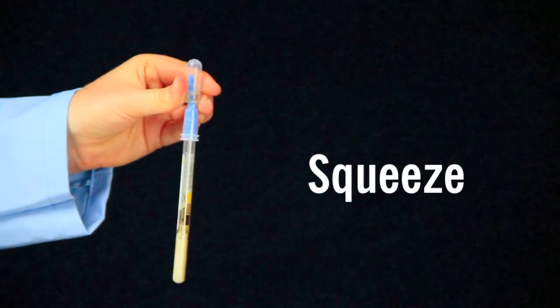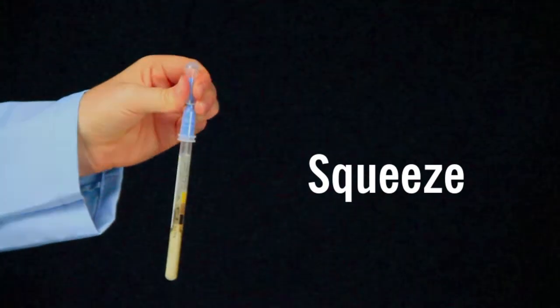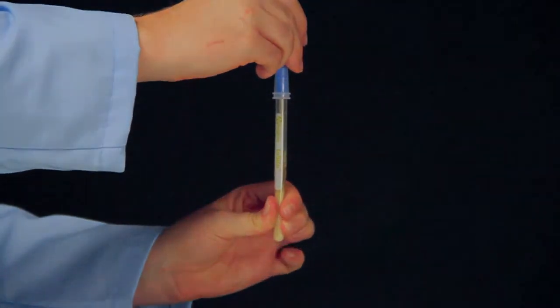Next, squeeze the bulb three to four times to expel liquid into the tube. Gently massage the bottom of the tube by squeezing the tube three times.